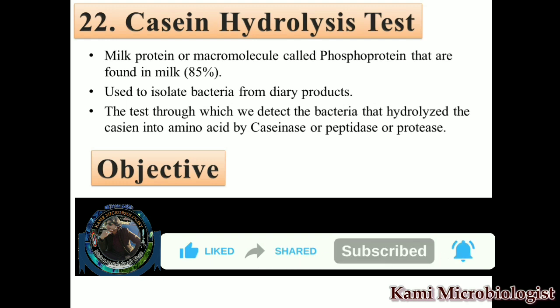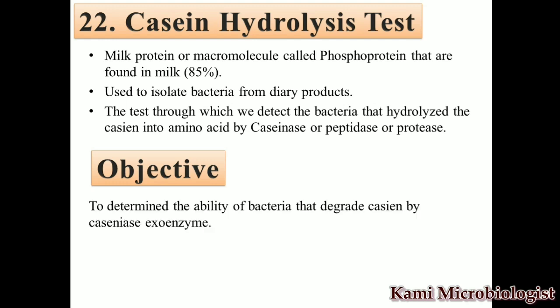Today in this video lecture we are going to see another biochemical test, that is about the Casein Hydrolysis Test. Now what is the Casein Hydrolysis Test? First of all, let me explain the casein. Casein is actually the milk protein. We also call it phosphoprotein.